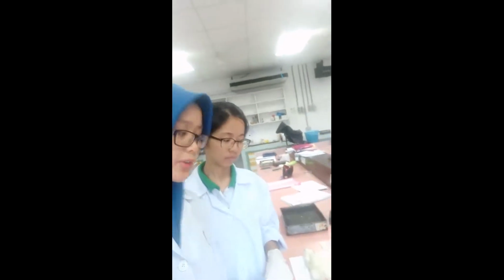Okay, today we are going to conduct practical 7B, which is mammalian anatomy. Today we are going to dissect this rat.